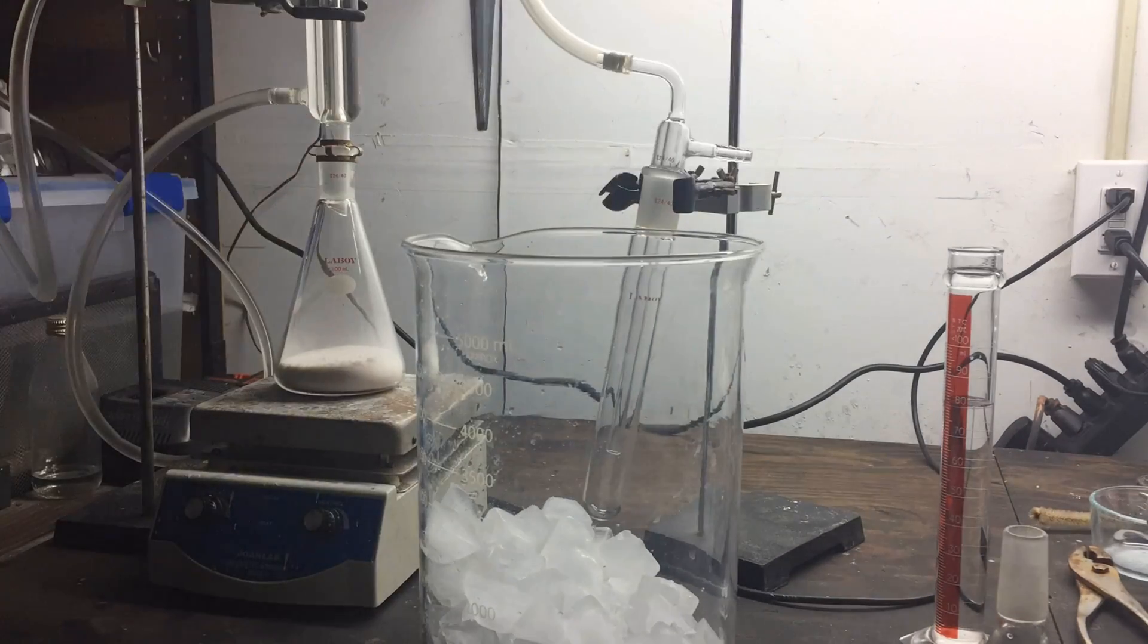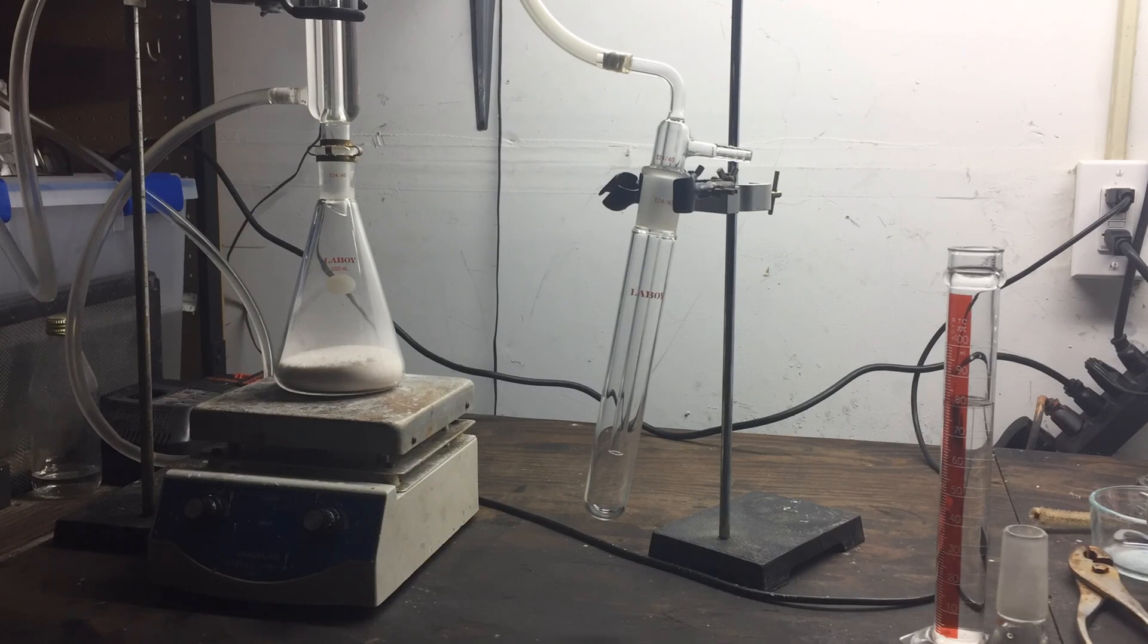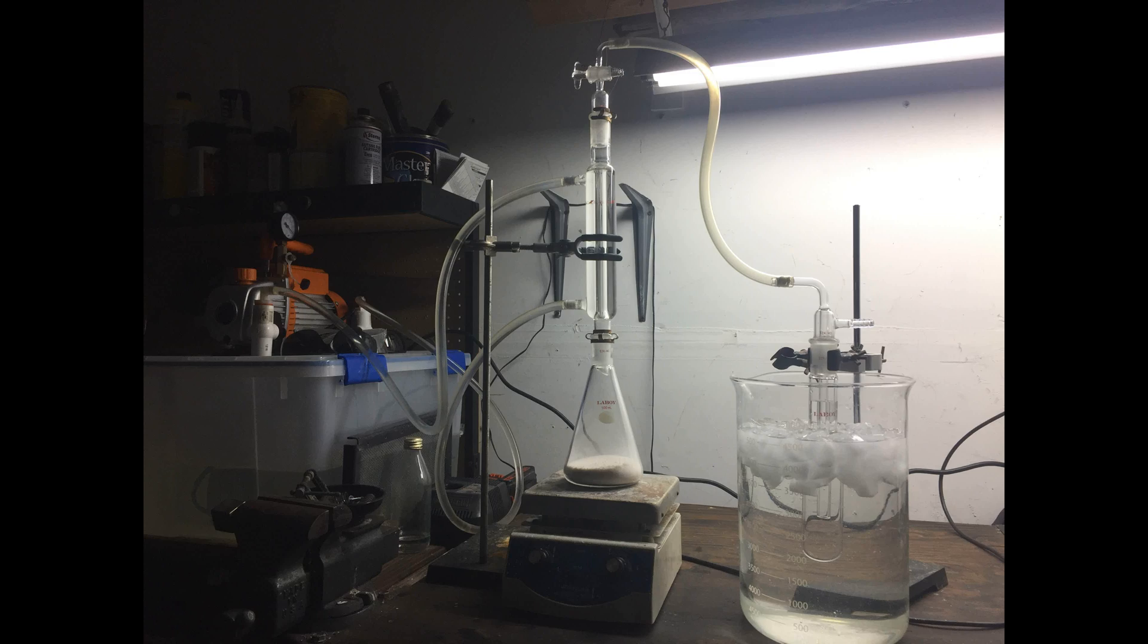Once everything was connected, water was attached to the refluxing condenser, and ice water was added to the large beaker to help the ammonia gas dissolve into solution. This is the finished apparatus you see here.